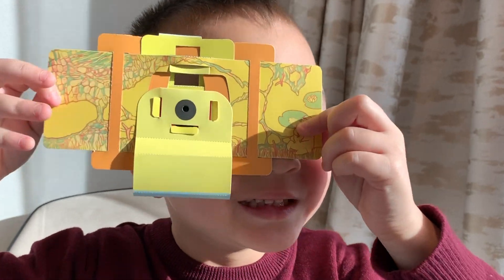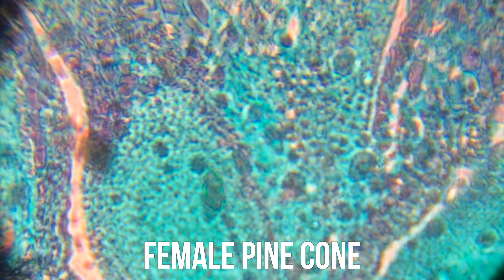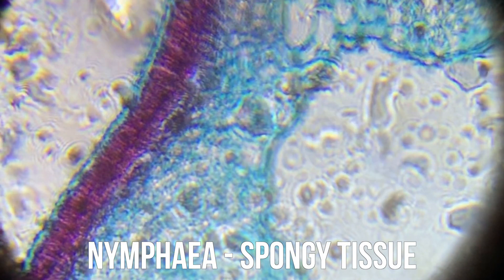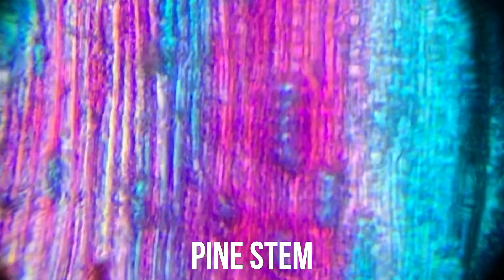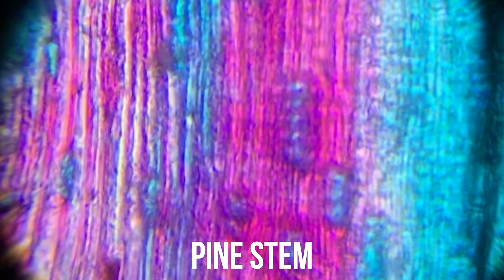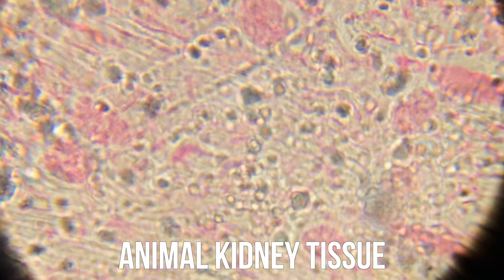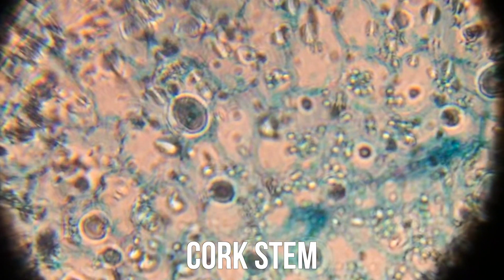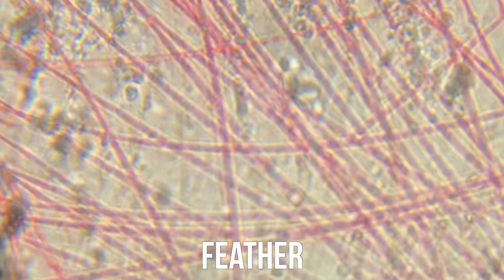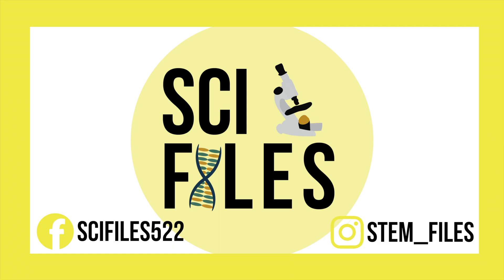Now it's time to test it out and see what we find. Here's what we saw in some sample slides: here is a Female Pine Cone, a sample of Nymphia Spongy Tissue, a sample from a Pine Stem, some Paramecium, a sample of Animal Kidney Tissue, a Cork Stem, part of a Feather, and a sample of Mammal Cerebellum. There are so many possibilities for what you can look at under a Foldscope microscope.